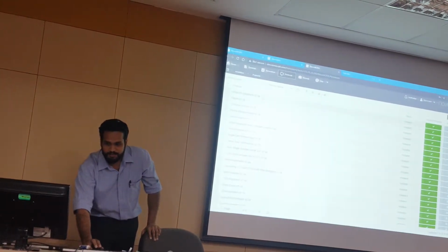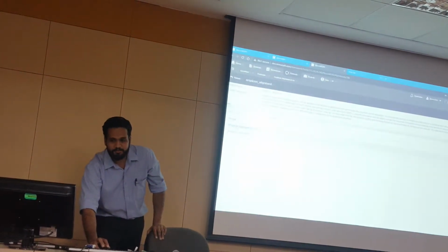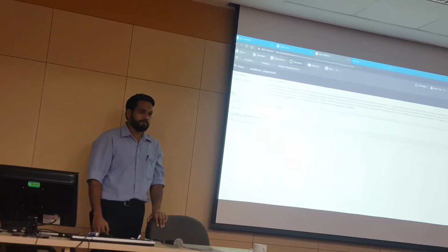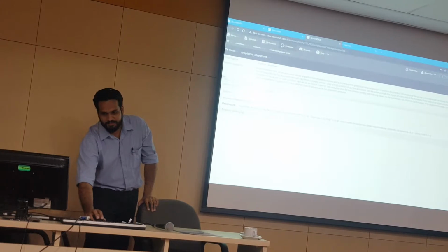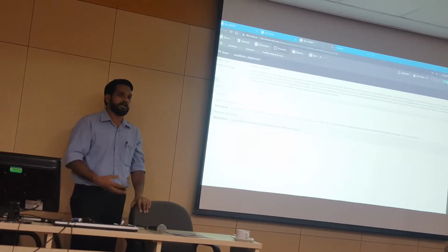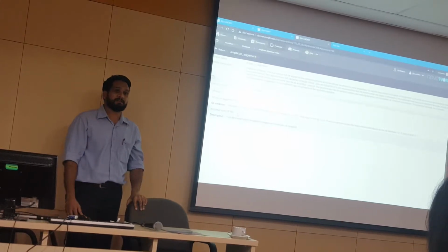For each of these, you can actually double click on this, and you can view what are the tools that are being used within novoWorx, within this protocol itself. And each of these has their own description. What is their function? What will be the outputs? What are they producing? And also the versions of the tools will also be provided here.